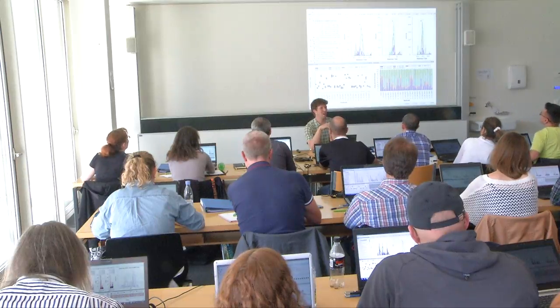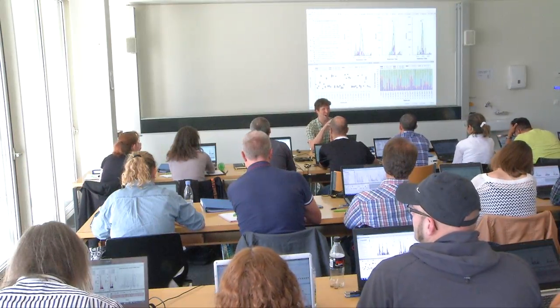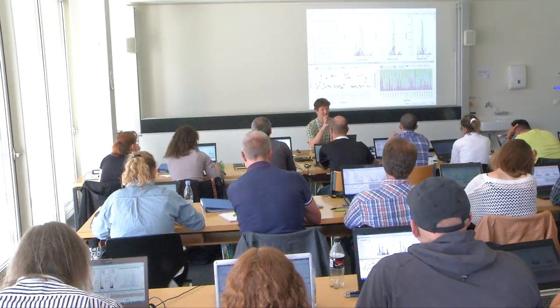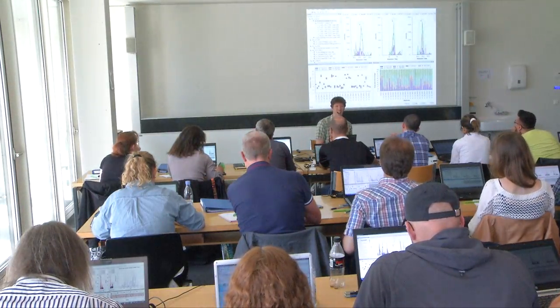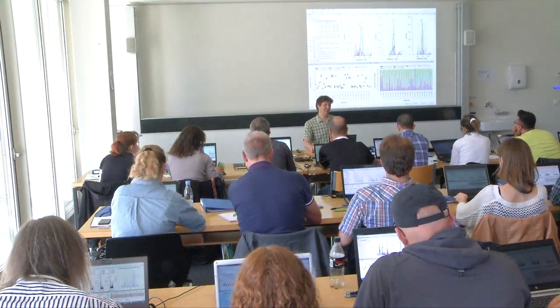Y3 is just barely better. So Y1 is just K or R. Y2 is K or R plus some other amino acid, and Y3 is just slightly better than that. So it's not a very selective ion, and so yeah, you want to pay some attention to this.